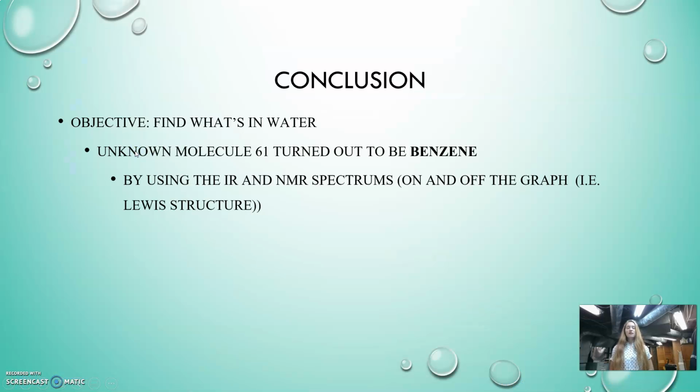In conclusion, my entire objective of this presentation was to find what was in my unknown substance. What I found was that it turned out to be benzene. By using the IR and the NMR spectrums, I was able to find my unknown compound.